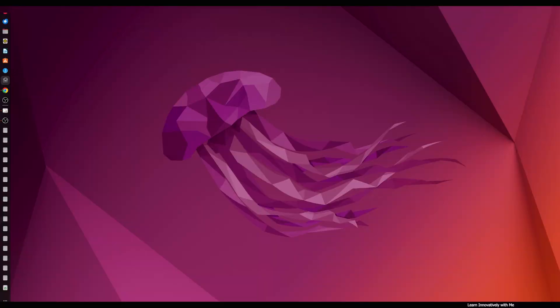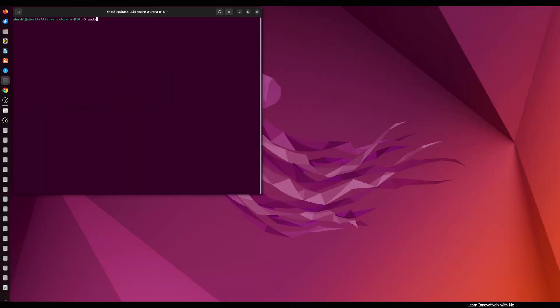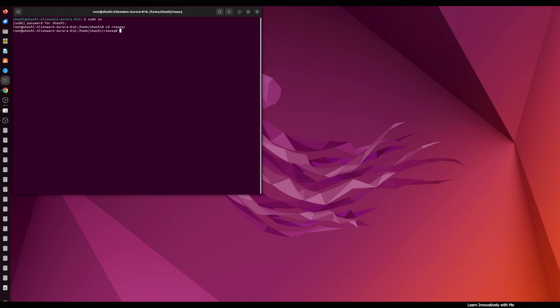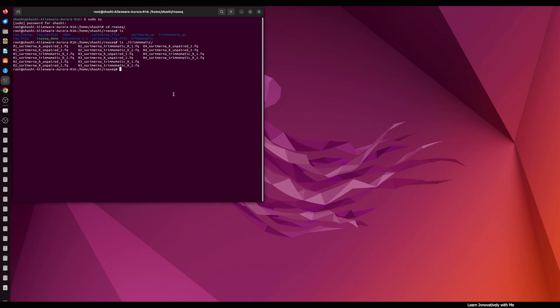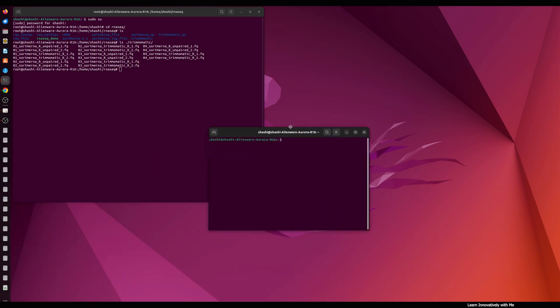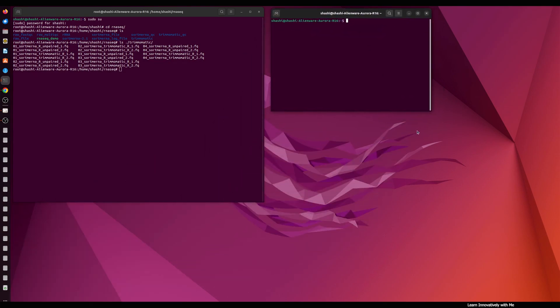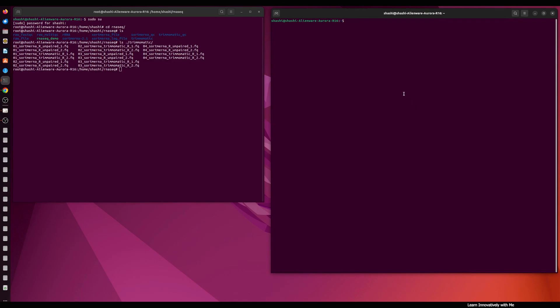I'm going to start my terminal, switch to root user with sudo su, and change the directory. I have trimmed FASTQ files in the directory and you can see the files. Now I'm going to open a new terminal window to show you the script file I'm using for the RNA-seq data analysis.